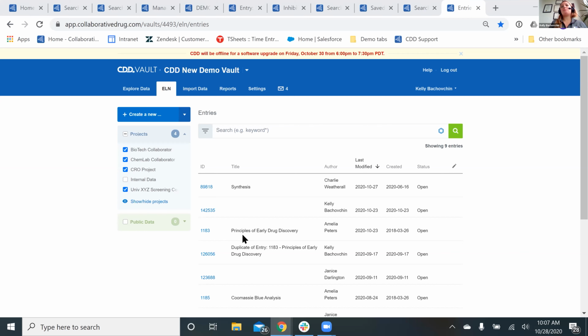And then after that, if you decide to purchase and go into production, I set up the new vaults. It takes me about 5 minutes to set up a new vault. And then usually there's a couple of training sessions with a support team member just to get you up and running, help you upload your data, set up the protocols that you want to upload your data to. So I would say within 1 or 2 training sessions, you're usually off and running, and then it's all up to you. And then we have this help section here.